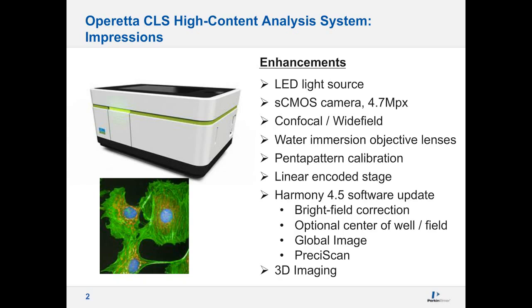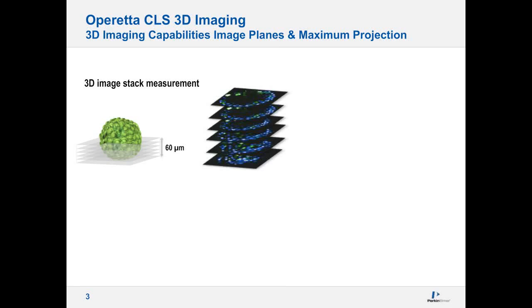I'm really impressed with the Harmony image analysis software and some of the new tools that Jacob just mentioned, especially the global image and PreciScan, which I'll be giving some more application examples of. I really want to start off and talk a little more about the 3D imaging aspect of the CLS instrument.